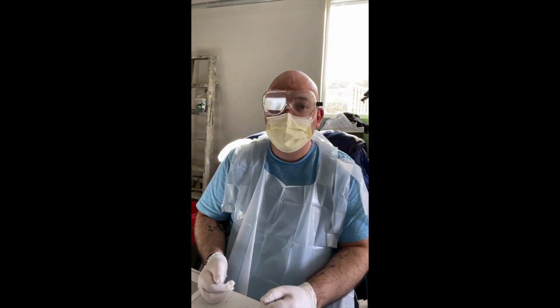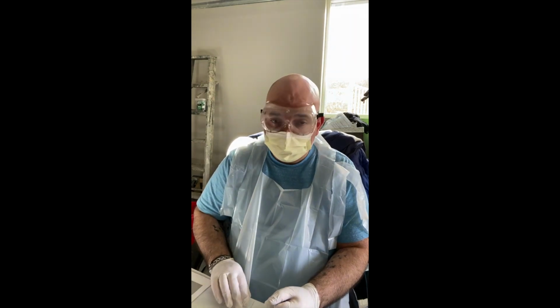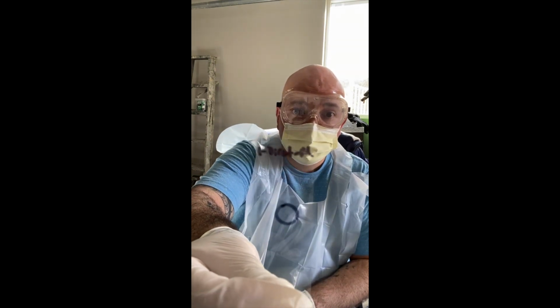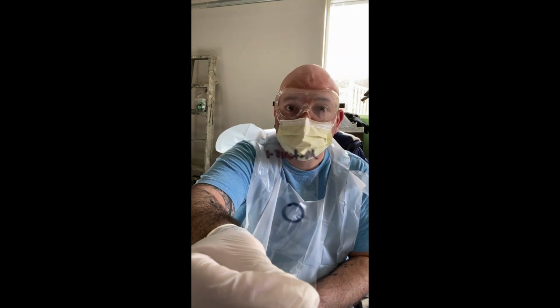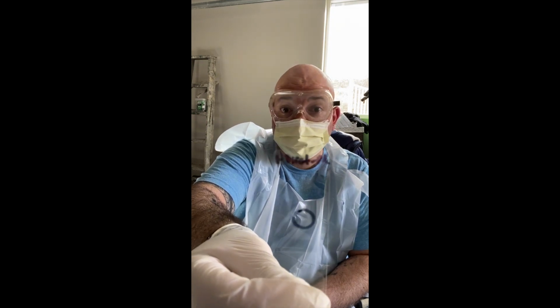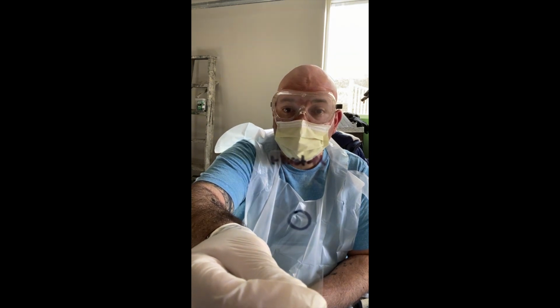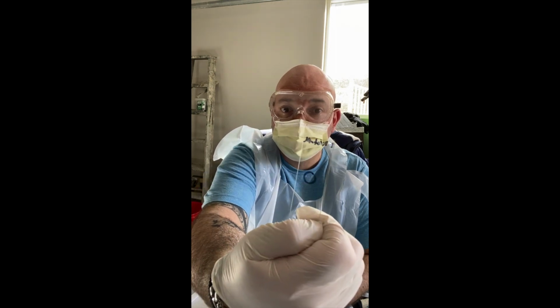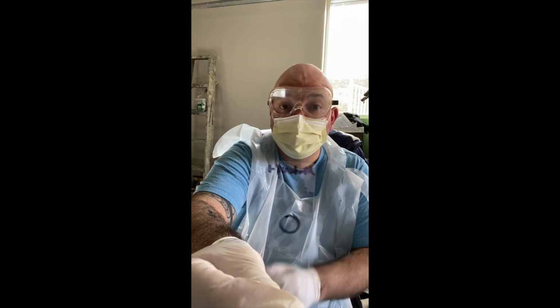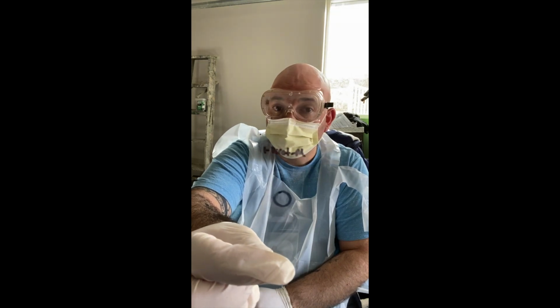Okay, so as I said earlier, I'm going to take 2 samples from my teeth and my gums. So I've gone ahead and labeled the first slide that I'm going to use, and hopefully you can see that it says 1 direct M. So the 1, of course, indicates this is the first sample or the first slide. Direct indicates that it's a direct sample or specimen coming from me, my teeth and gums, and M means it's coming from the mouth. The circle that you see is drawn on the underside of the slide, and it's just to give me a guide of where to smear the specimen on the upper portion or the upright portion of the slide once I collect the specimen.